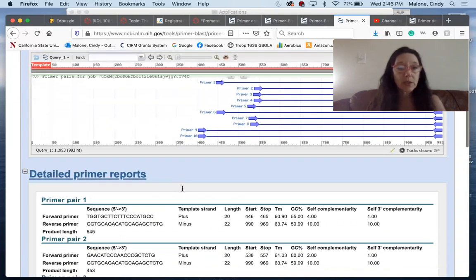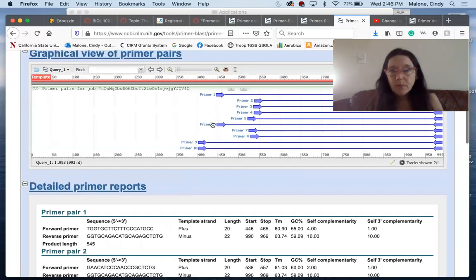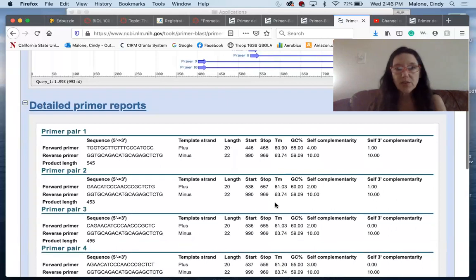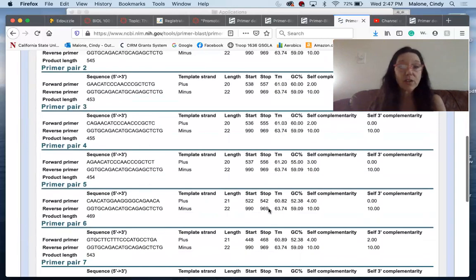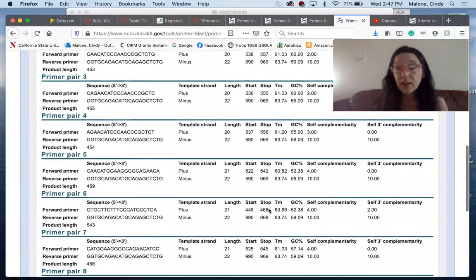So if we looked at primer 1, which is this big guy out here, then here's his story. Right, melting temperatures, GC, this melting temperature is closer than that one. That's about the same, so we can look through all these different pairs and see how good they look.